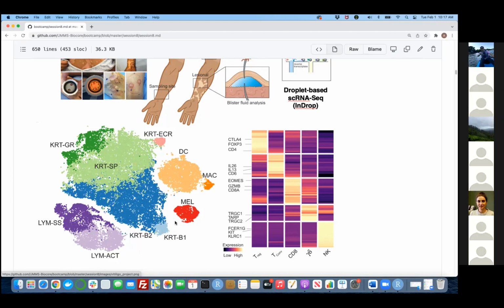So dimensionality reduction is really important, especially in single cell data. But this kind of dimensionality reduction is actually unique to single cell data as well. So that's why I believe that single cell data is a little bit more mathematically complex, which brought out the potential of advanced machine learning algorithms, and we're going to talk about each of them briefly, and we will see how we can easily execute these algorithms without knowing too much about any of them.